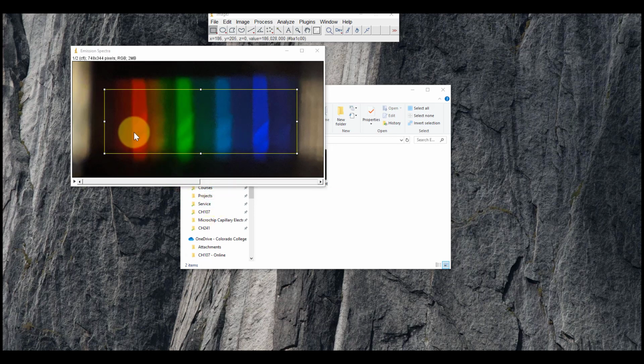Okay, so now what we want to do is essentially average all of the intensities of each pixel in line vertically. So if you can imagine from the left to the right, there might be 1,000 pixels, 1,000 dots on the screen, each one of them registering some grayscale value, some intensity on the screen. What I'm essentially doing is taking everyone that's in a vertical line, and I'm averaging each of those vertical lines, so I get an average intensity, and then I'm going to plot that as a function of the pixel position, which is moving from left to right. That's the literal pixel on your camera phone.